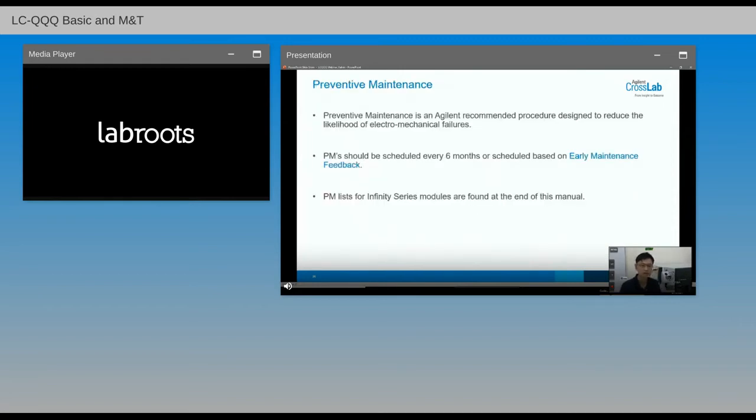Therefore, as you can see, most of the time we might be injecting quite dirty samples in there, right? It's good to have a sample prep prior, or at least do some kind of sonication, and then do the supernatant extraction or solvent extraction.